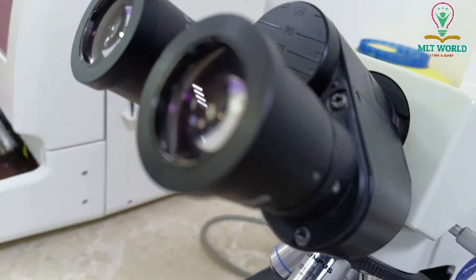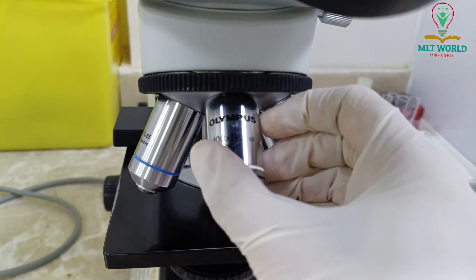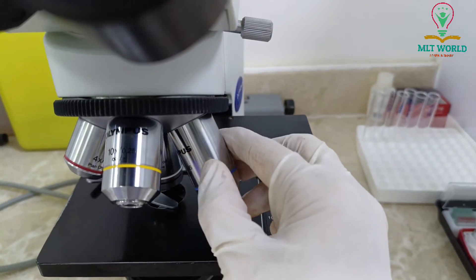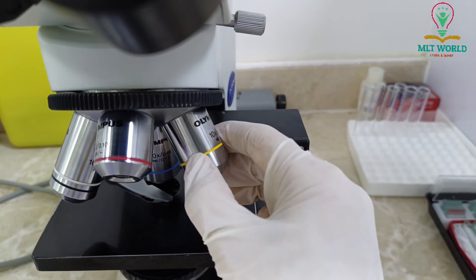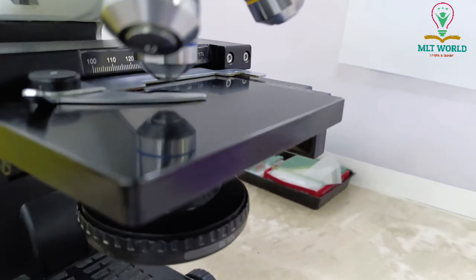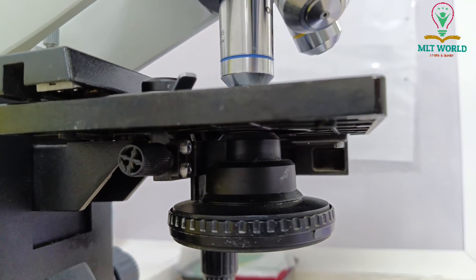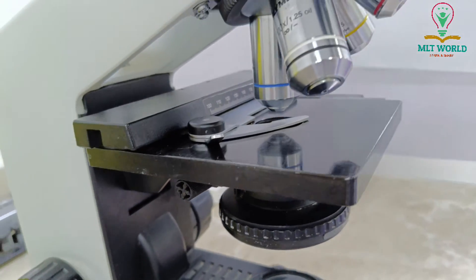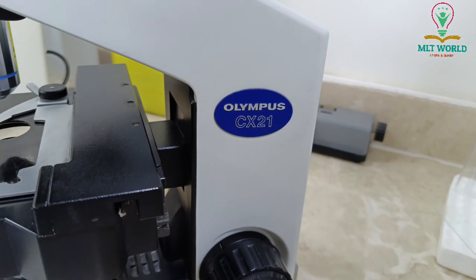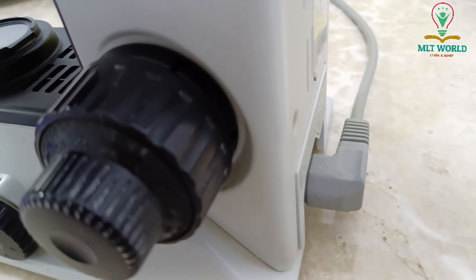This is one of the best microscopes we can use in the laboratory. It is a little bit expensive than other microscopes, but once you buy it, it is worth it — about 15 to 20 years. You will not find any problem with this microscope as long as you maintain it nicely and do daily routine cleaning and lens cleaning.